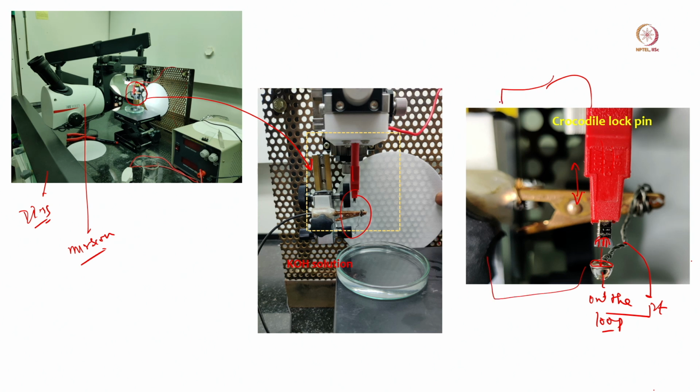Okay, so this is how we usually do the electropolishing for the specimens, and the electrolyte depends upon the material which is investigated. Correct. So this is the most versatile method for preparation of atom probe needles or field ion microscopy needles, but the only disadvantage is that we cannot make site specific needles wherever the precipitates or interfaces are needed.